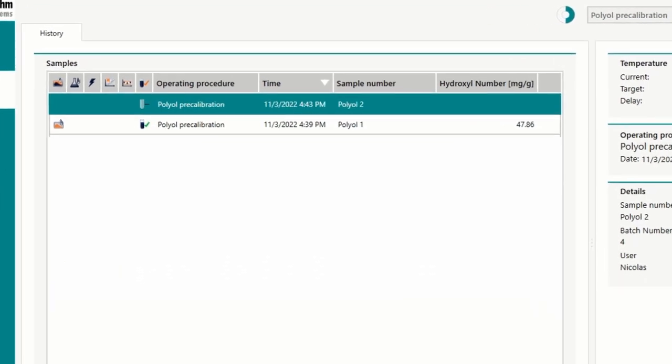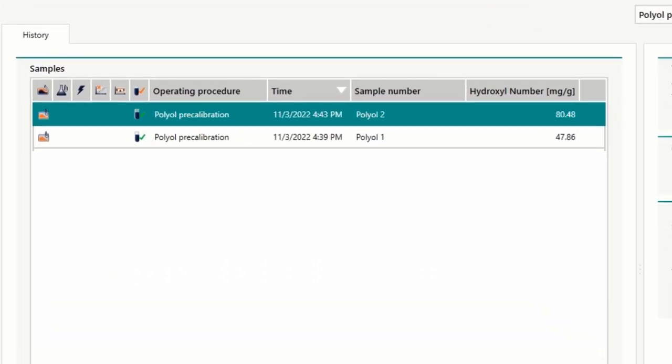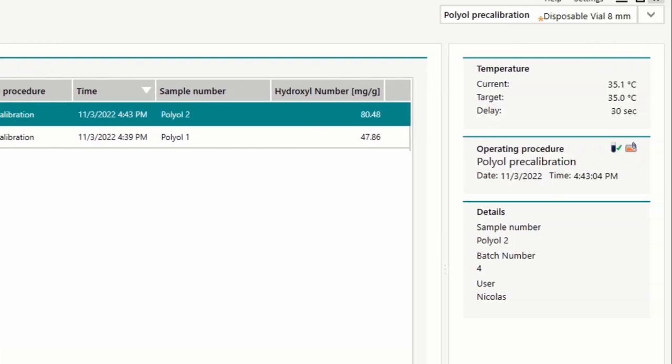In less than a minute, hydroxyl number or NCO content are displayed. Further important metadata for the respective analysis can be seen at a glance.